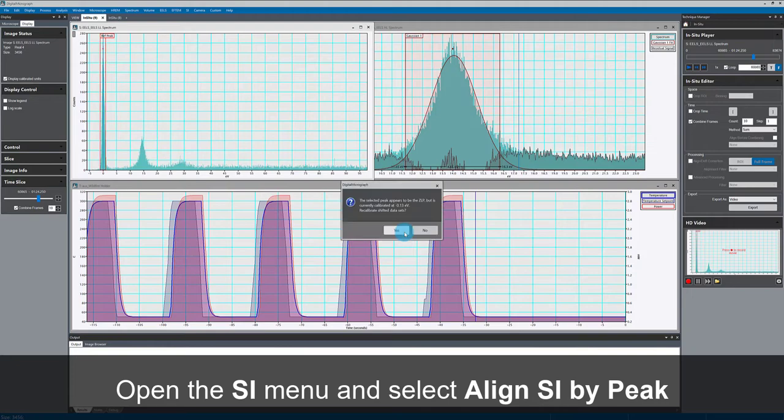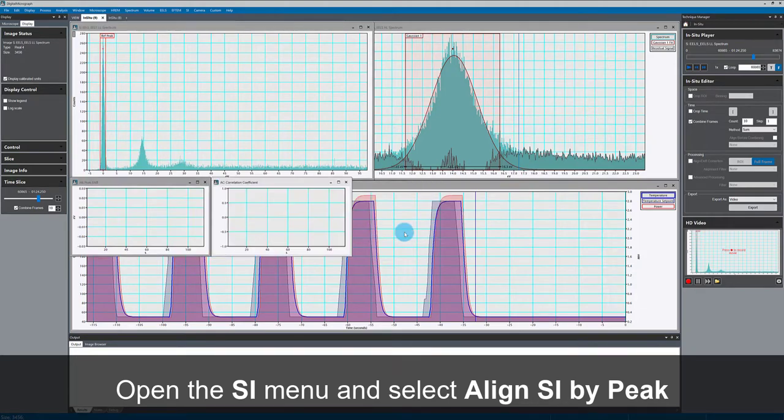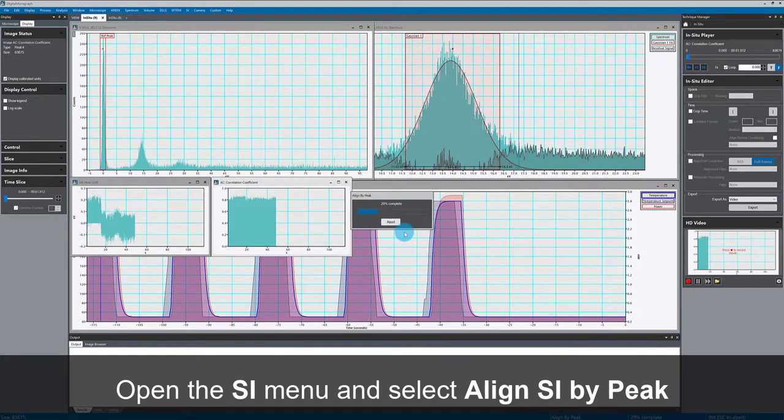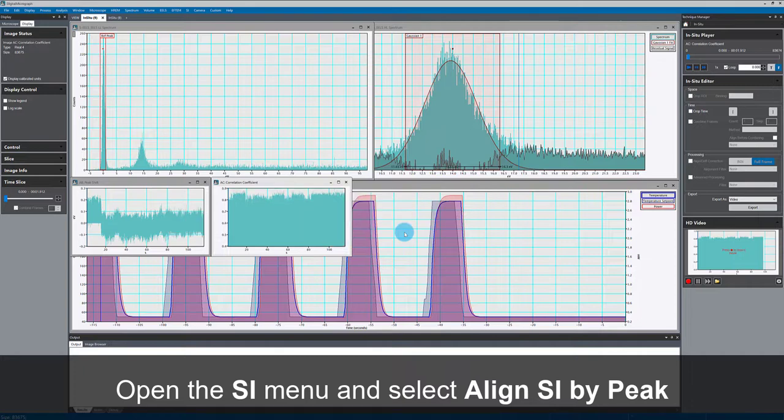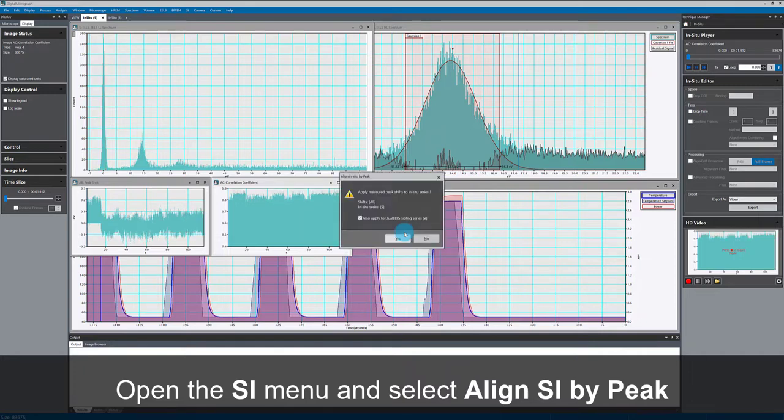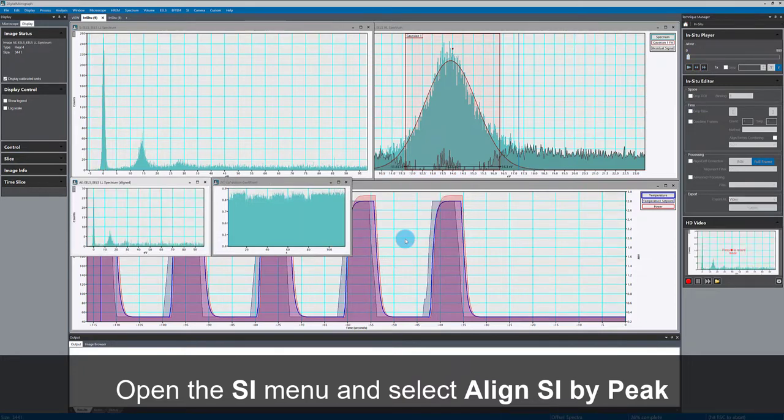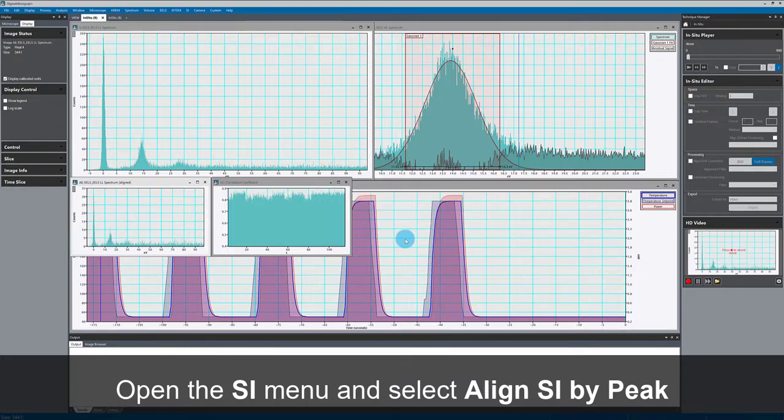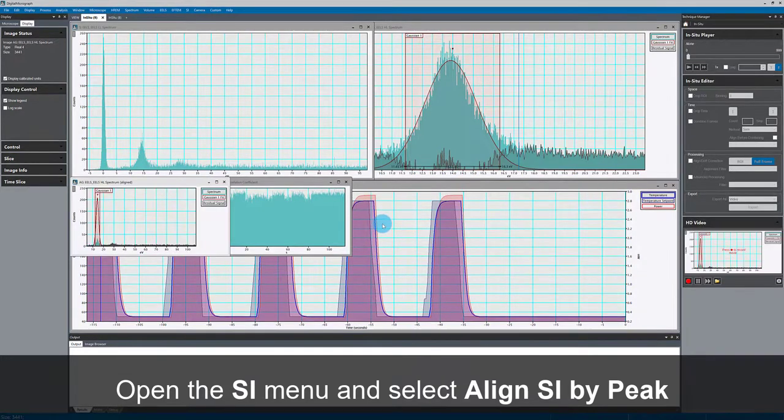I can do this quite easily in the software. This will not only align the low loss part of the data where I'm measuring the zero loss peak, but also the high loss portion.